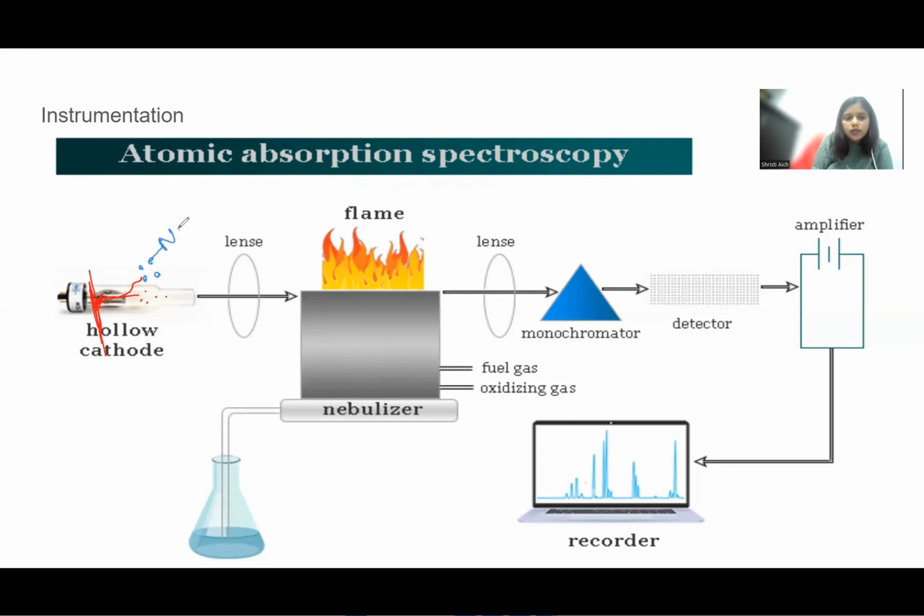So this is your sodium atom, and coming back to our favorite red, this is our inert gas. Now we will revise it. Firstly, voltage is applied, and because of the voltage, these inert gases get charged or ionized and become fast moving.